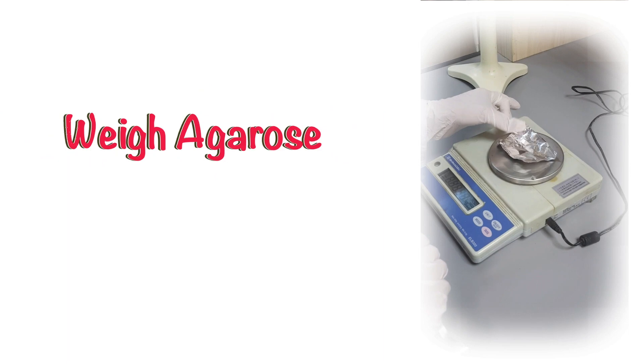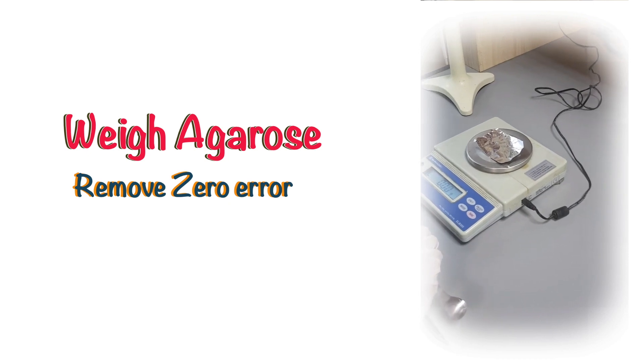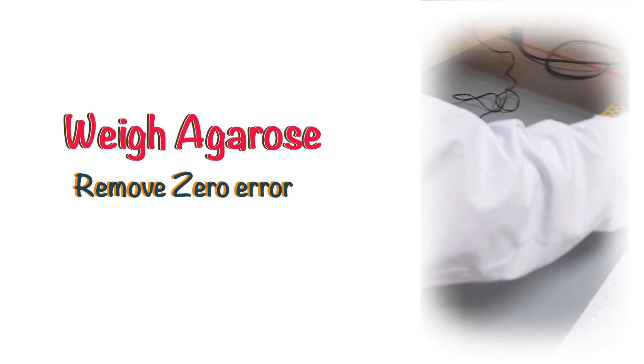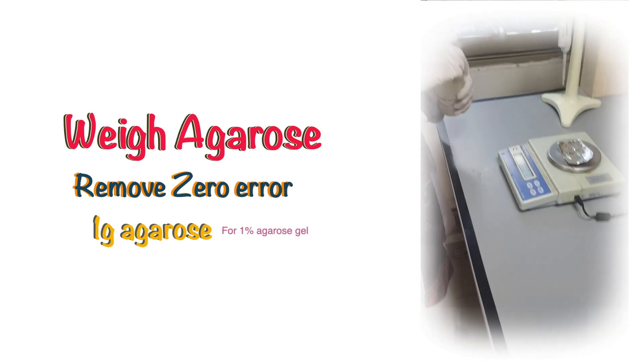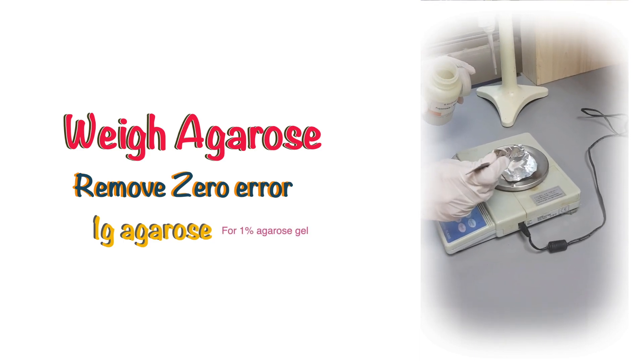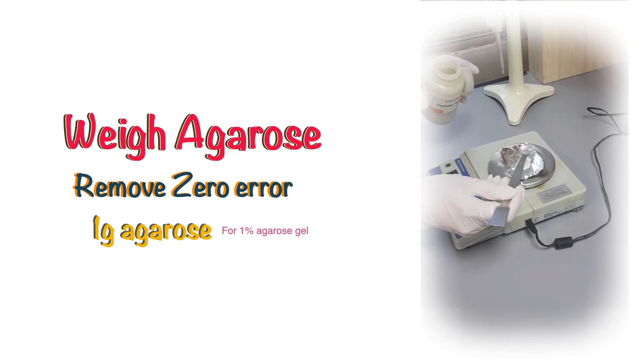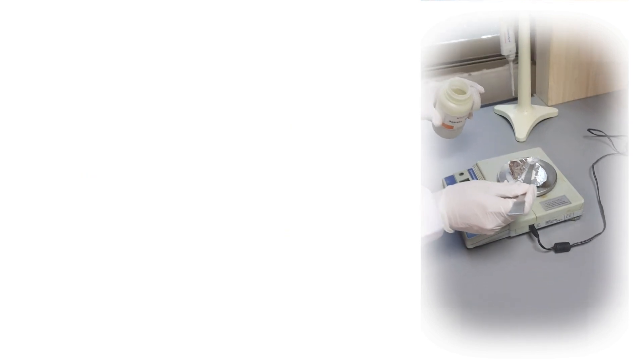First of all, we have to weigh out 1 gram of agarose. For this purpose, turn on the electric balance. Place aluminium foil and press the button to tare, then weigh out 1 gram of agarose.